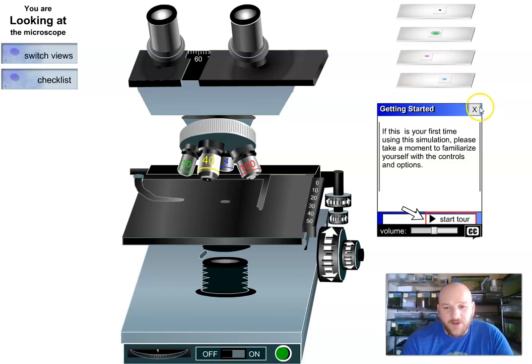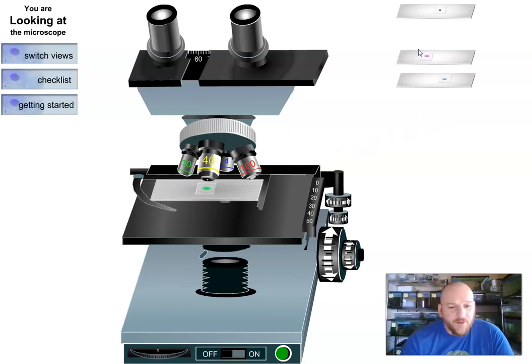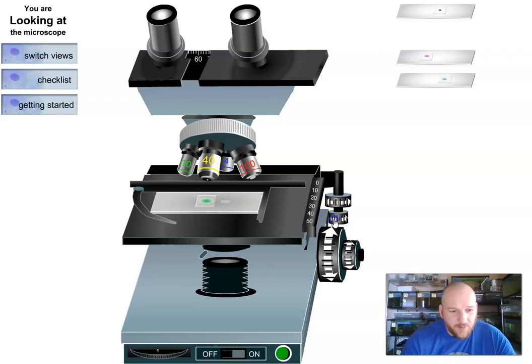The get started here gives us a tour but we're just going to go ahead and give it a shot. Let's take a look at our onion root here, so we'll click on that and drag it over. In the getting started it tells you a little bit about how to adjust things, but here we're going to try and move this little guy so it's up over the diaphragm and turn on our light source down here at the bottom.